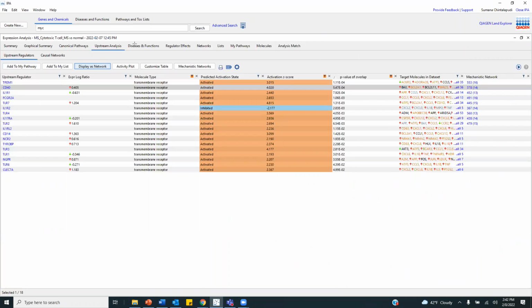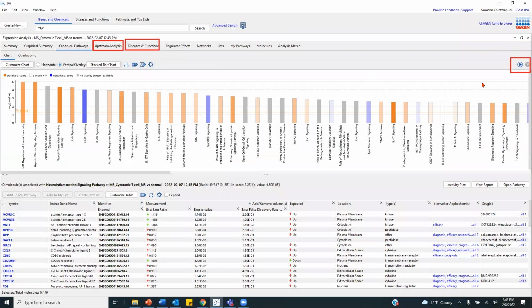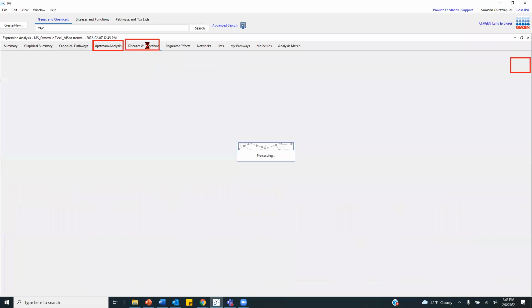I think we have some more time, and I want to focus on two other topics that I wanted to cover. But basically, if you want to look at some of this information down in this list of tabs, you can go into each section, and you're going to find this video icon and this question mark button. And this is going to give you brief information about that particular section and how to interpret some of the data that's there in this section. So each tab will have this video and question mark button.